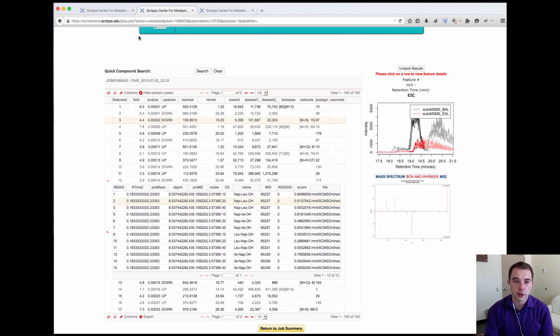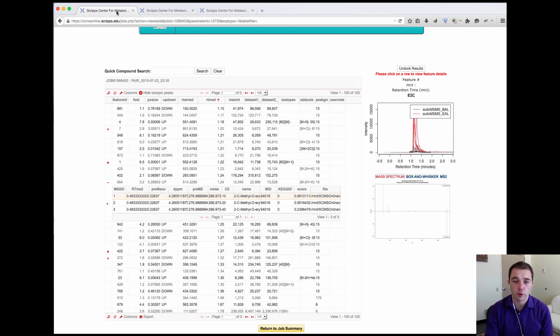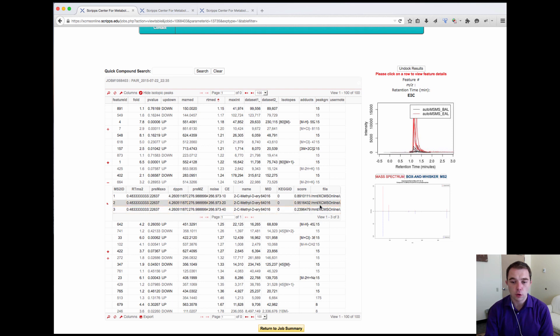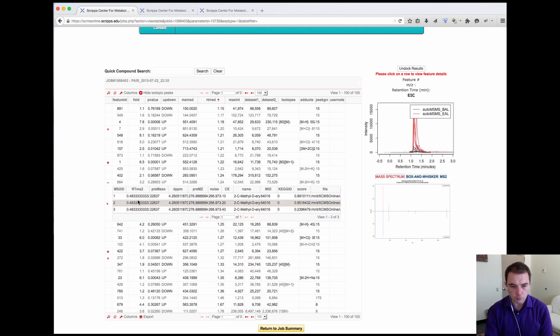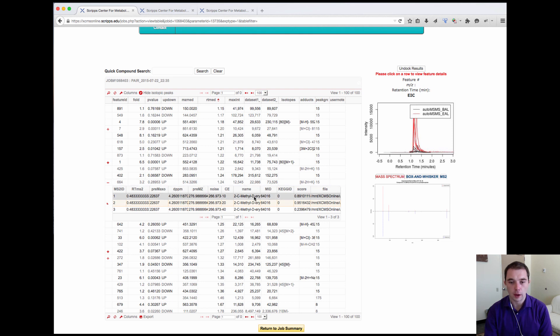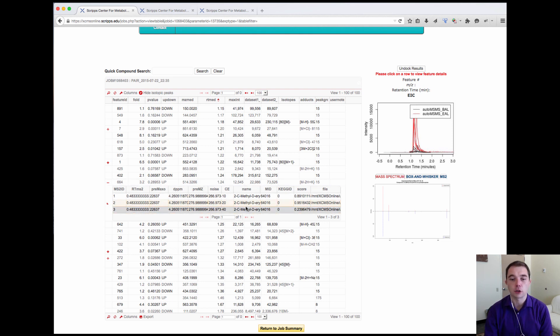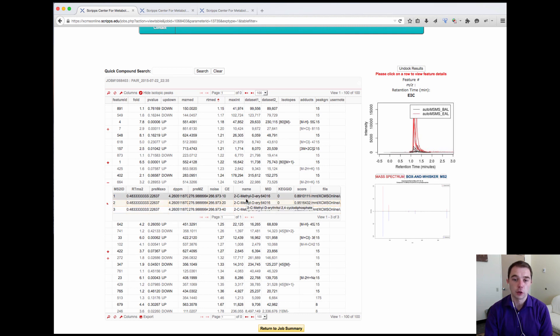I just want to take you to one of the examples that I've already looked at before which had a very good match. You can see that this particular feature here had only one compound that was matched at all three different collision energies.